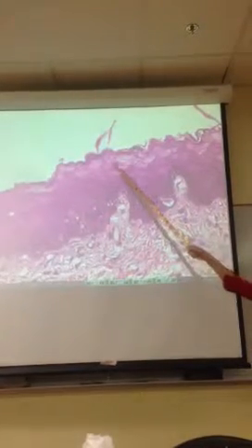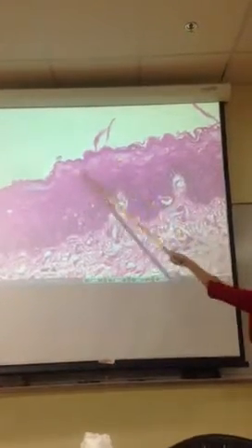How about this tissue? Identify this type of tissue here at the tip right here. You guys recognize what that tissue is? We're in the epiglottis, the larynx. Identify the type of tissue from here all the way to the top. Stratified squamous — and non-keratinized. Excellent, Jackie. Non-keratinized there at the top. Very good.